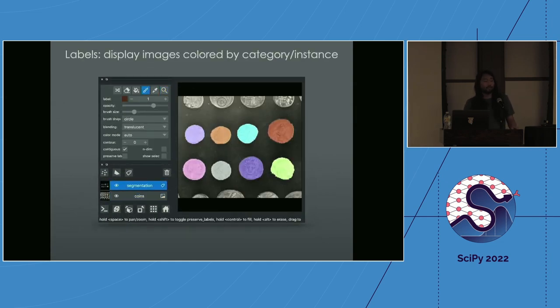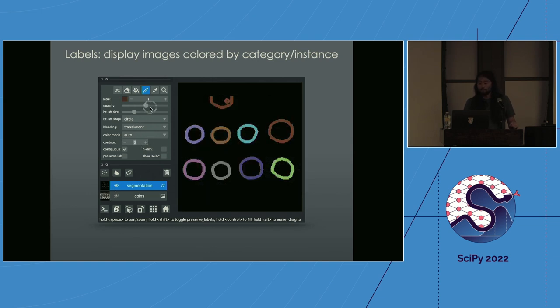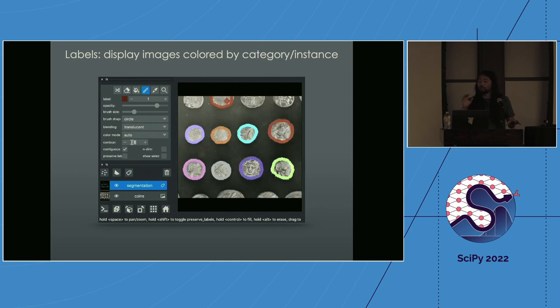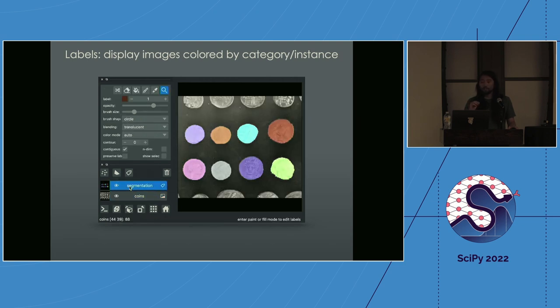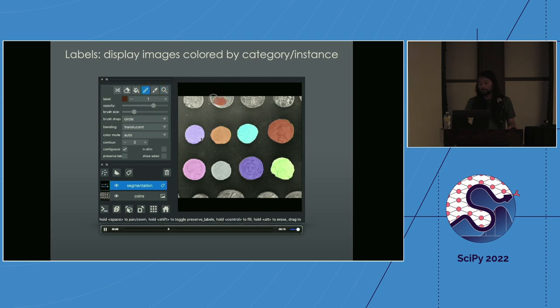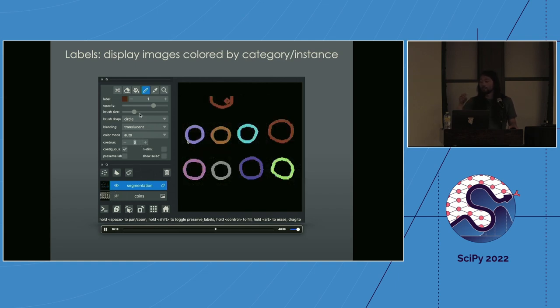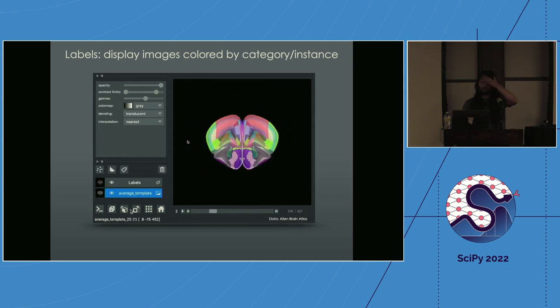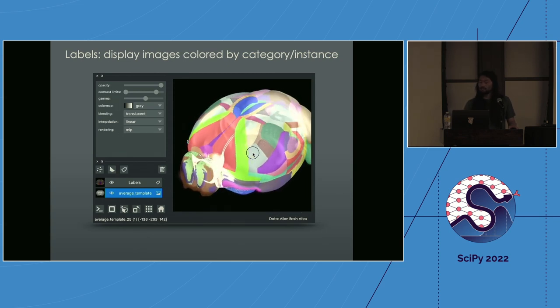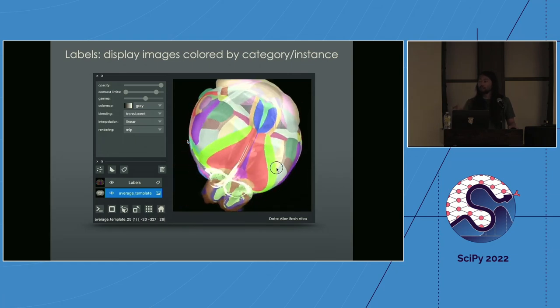A closely related layer is the labels layer — a special type of image most commonly used in segmentation. For example, looking at an image of coins, each pixel has an integer value denoting which instance or class that pixel belongs to. All pixels for one coin share the same value. We can view these in three dimensions — for example, the Allen Cell Brain Atlas mouse brain, with different regions annotated by different colors.